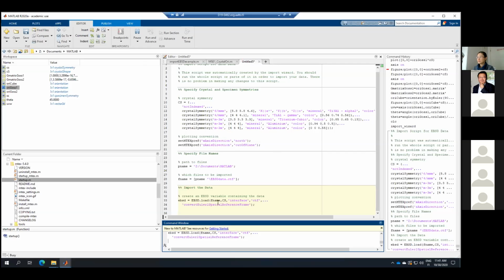You can see this one. It's extract the EBSD data. It's still running. And after running, you will see that here is a new data structure here. It's EBSD structure data. And here is totally EBSD measurement points.